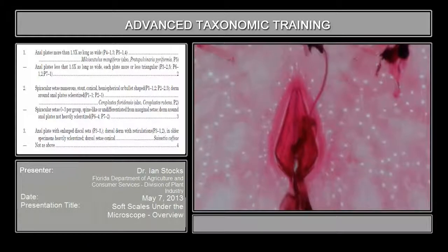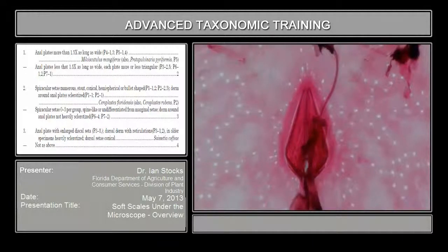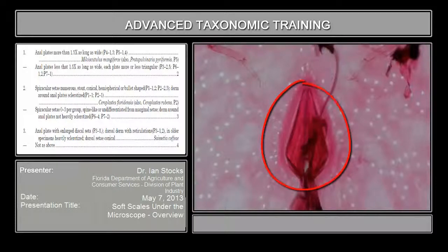Now we're going to get to the key feature that you want to look for when faced with a slide of possibly a soft scale. This is a character that is diagnostic for the soft scales. These are the anal plates. Each one is an operculum. Together they form the opercula. So they're a paired structure.